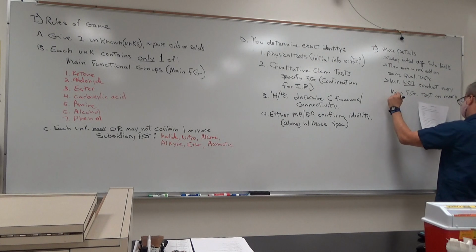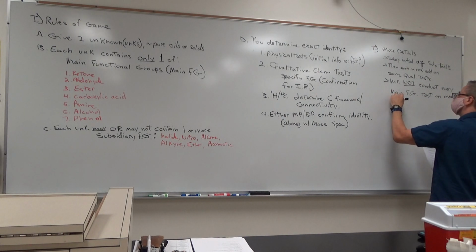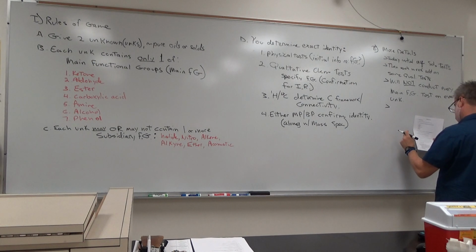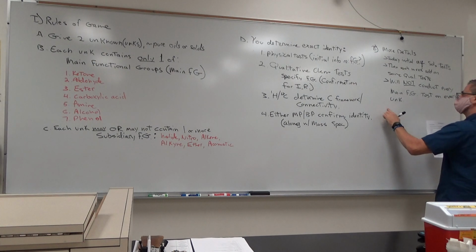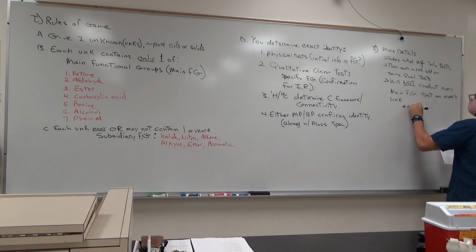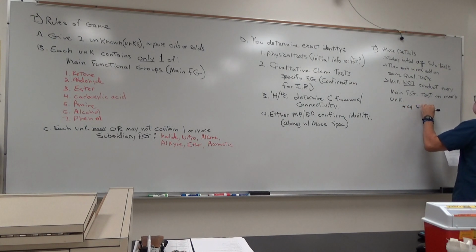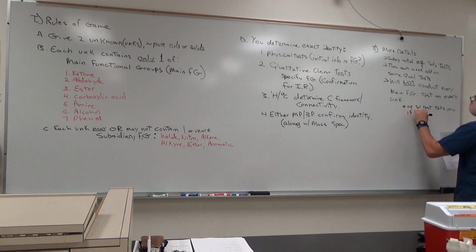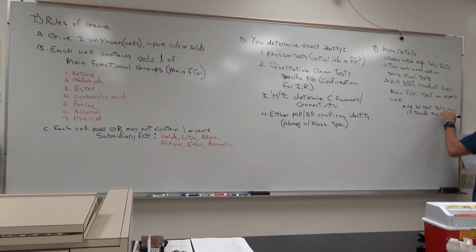I've said this six times now. The aqueous solubility test tells you if you should try a qualitative test.